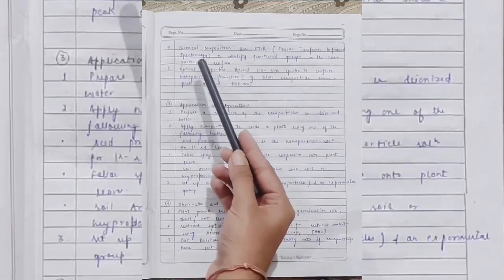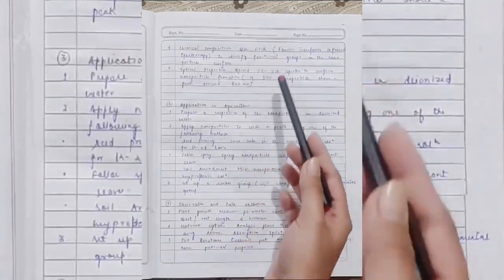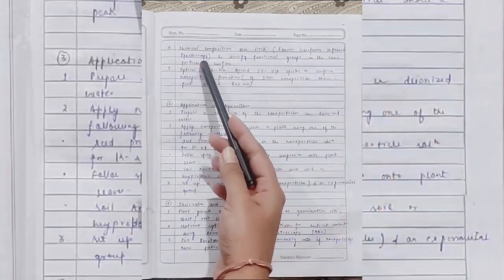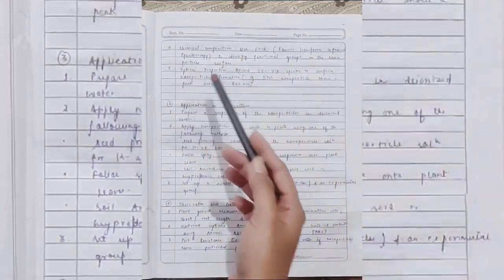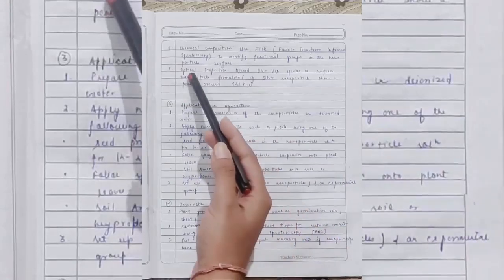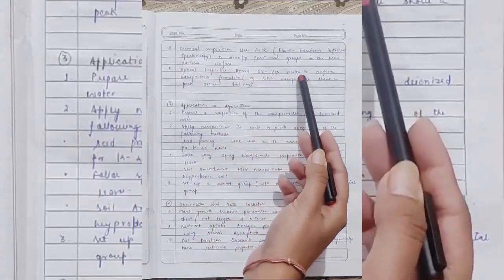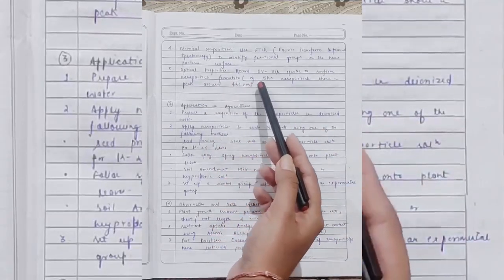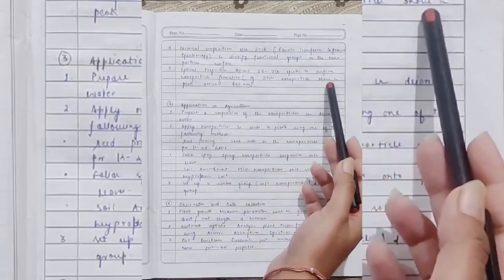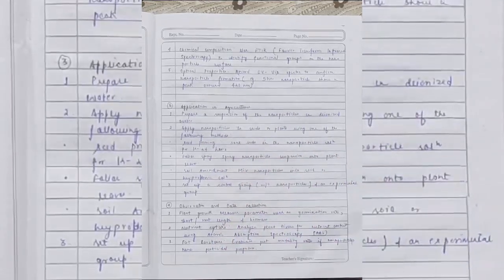And the fourth one will be chemical composition. For that, we will be using FTIR, that is the Fourier transform infrared spectroscopy, to identify the functional groups on the nanoparticle surface. And the fifth one being optical properties, we will be recording the UV visible spectra to confirm nanoparticle formation. For example, silver nanoparticles show a peak around 420 nm.